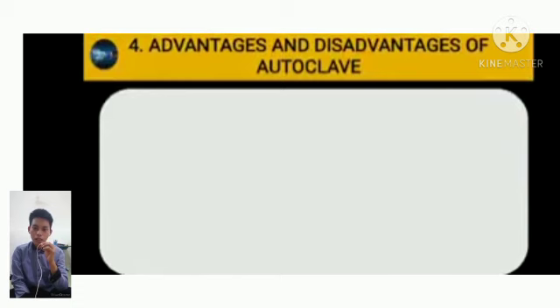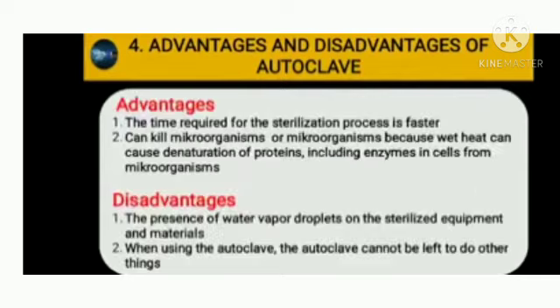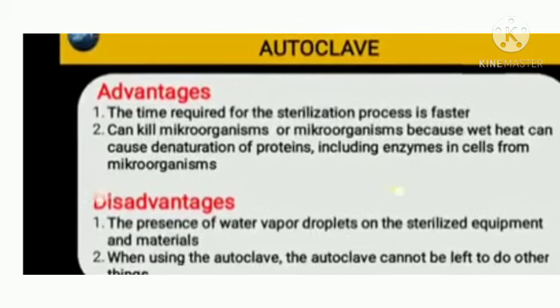Okay, then we go to the advantages and disadvantages of the autoclave. Advantages. 1. The time required for the sterilization process is faster. 2.